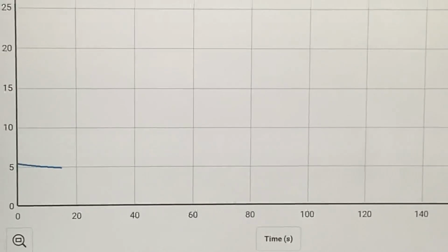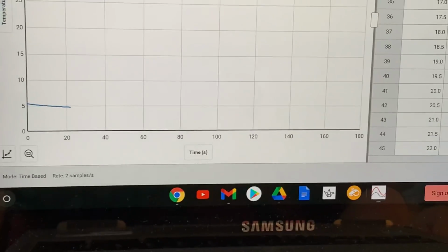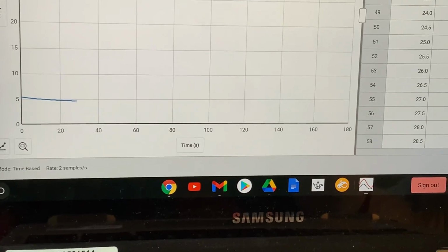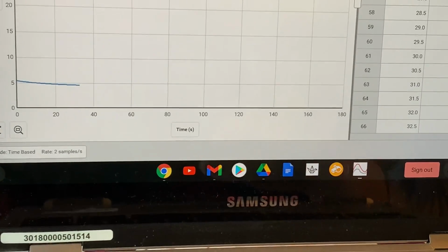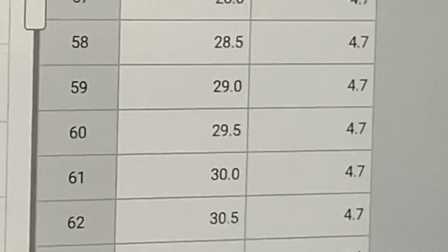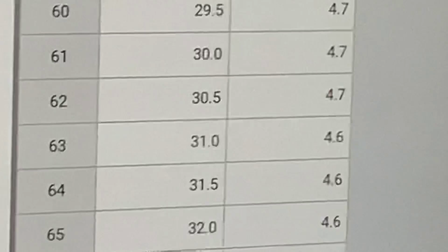So we're going to stop the probe when it gets to 30 seconds again. So right now it's about 20 seconds. So I'm looking at my data table to see when it gets to 30 seconds and see what temperature it is. Okay, so it's gotten to 30 seconds. So I'm going to zoom in so you can see the temperature at 30 seconds. So at 30 seconds, it was 4.7 degrees. So we're going to round that up to 5 degrees.